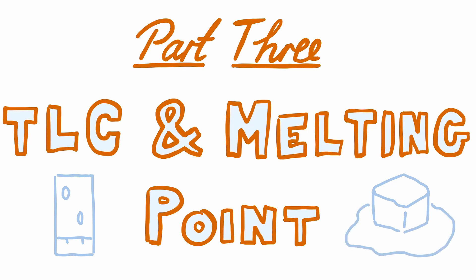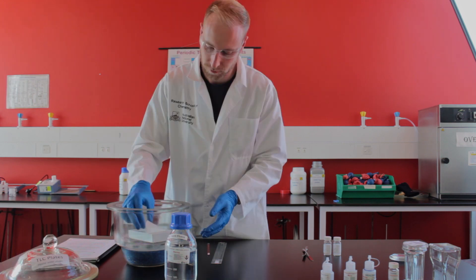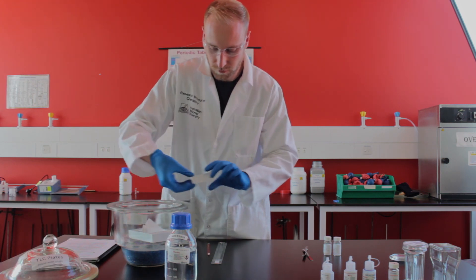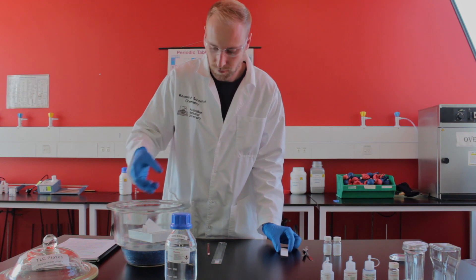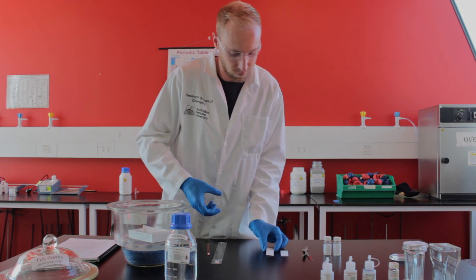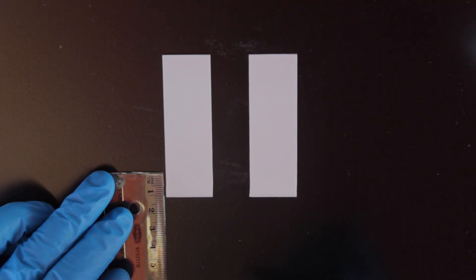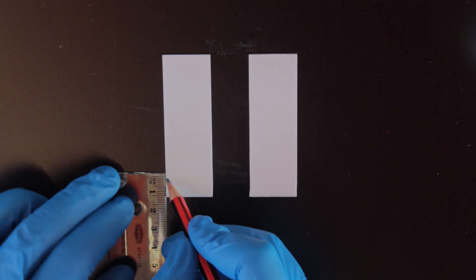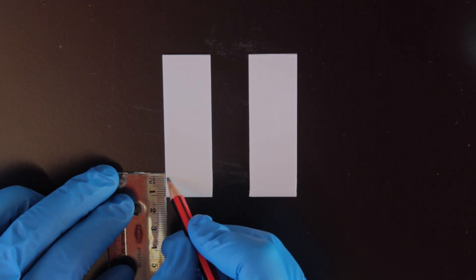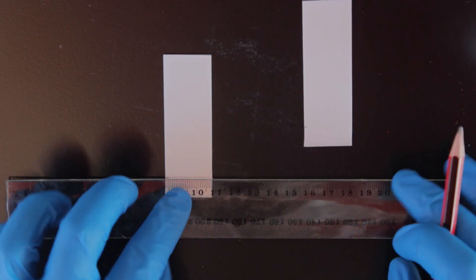Let's prepare our TLC plates. Carefully slide off the lid of the desiccator and pull out two TLC slides. The plates are covered in silica gel which will act as the stationary phase for our chromatography. Make sure the surface of the slides is not damaged and handle with care. Use a pencil to lightly draw a sample line about 1 cm above the bottom of each plate. Avoid applying too much pressure as this can scrape the silica gel surface.